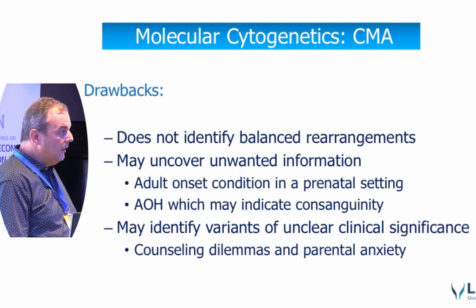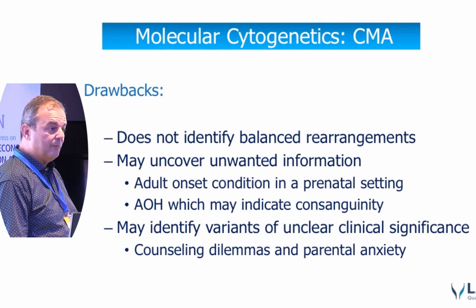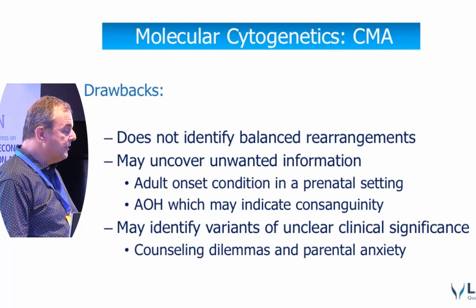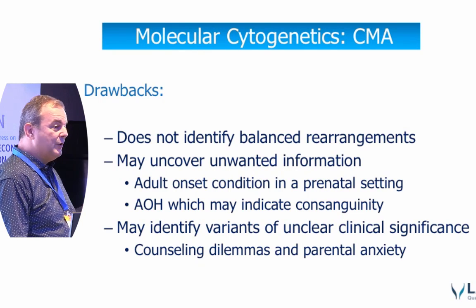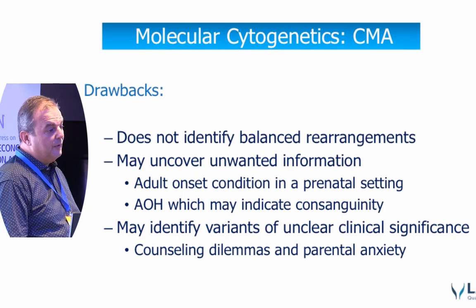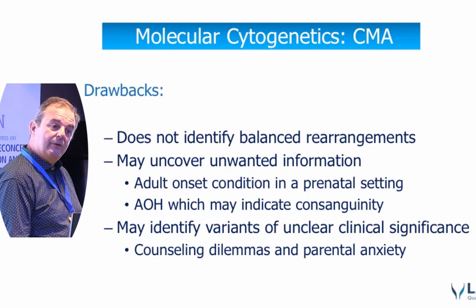The advantage is that the molecular karyotype identifies both microscopic and submicroscopic imbalance. It is similar in principle to doing simultaneous FISH experiments with thousands or even millions of probes, depending on the array. The main advantage, especially in prenatal diagnosis, is that you don't need a specific phenotype indication to use the study, because you are going to analyze the whole set anyway.